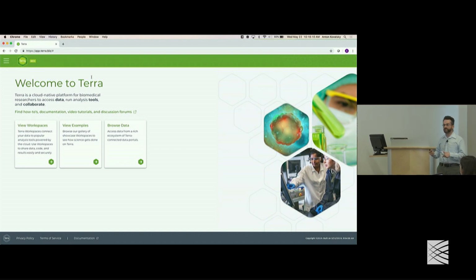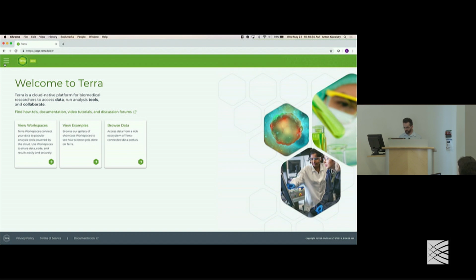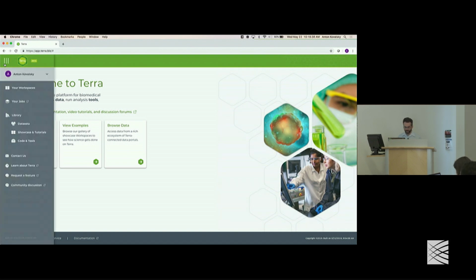But when you are first opening a notebook before you have generated the cluster, it may take between like 10 and 15 minutes for Terra to communicate with the cloud and spin up the virtual machine to the exact specifications, because you spin it up to those specifications every time. So ultimately, it's very nice. But there is this one little bit of downtime that sometimes you need to take into account.